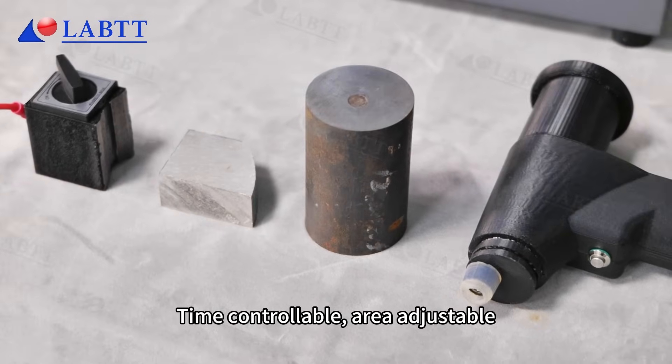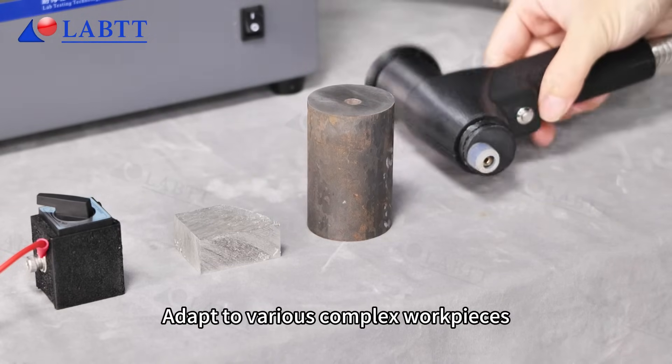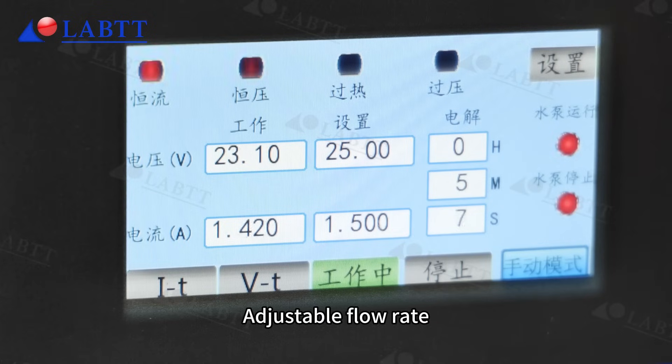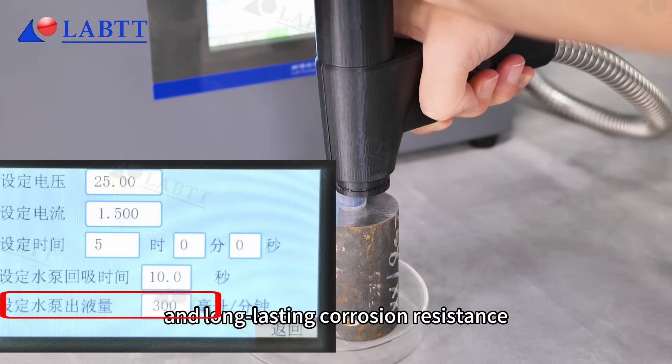Time controllable, area adjustable — adapt to various complex workpieces. Press the switch to perform electrolytic polishing and etching. Adjustable flow rate ensures consistent and long-lasting corrosion resistance.